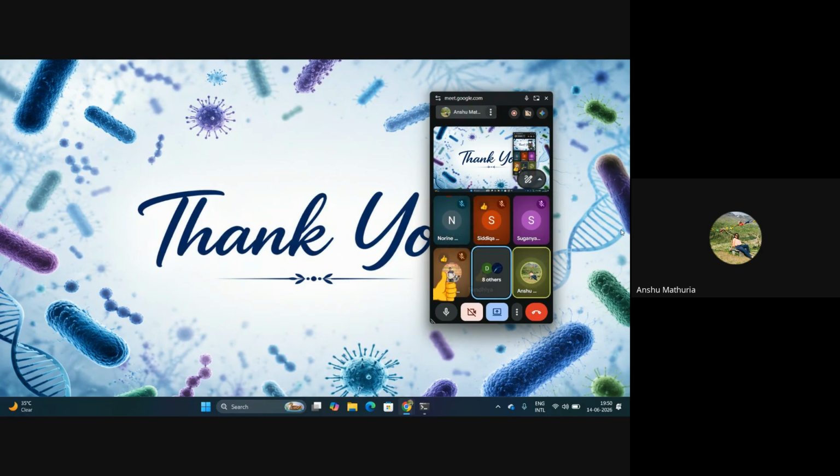I know it was a pretty long session for the day because we covered a lot of practical aspects today. So I request everyone to practice the commands and the Conda things as well. Once you are thorough and clear with it, in the next session we are going to cover the QIIME analysis. I will be giving the commands for installation of QIIME. So people who haven't installed Linux and Conda should install them and keep them ready before the next session so that you can install QIIME as well. Then we'll understand about QIIME, what the tools, plugins and everything related to QIIME are, in the next session. So that's it for today's session.